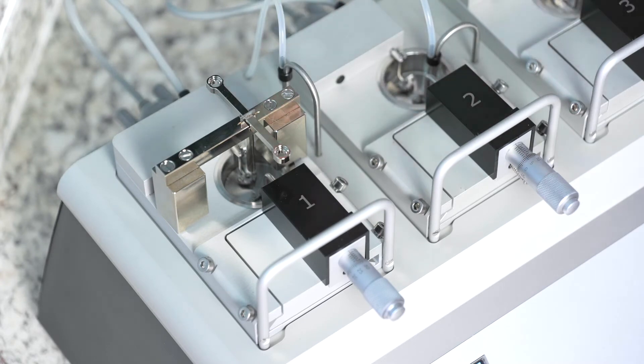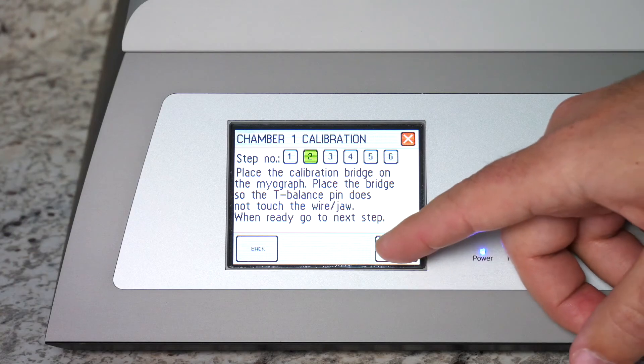You want the T-balance to drop in behind the wire on the force transducer side as close as possible to the wire without touching it. And then hit next step.